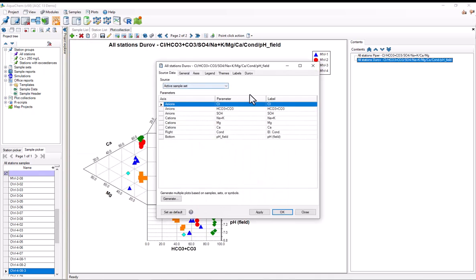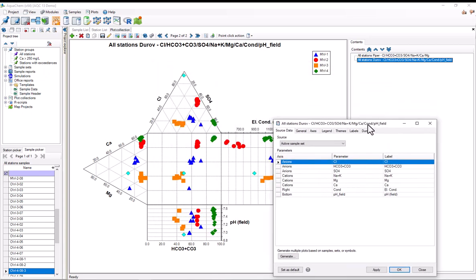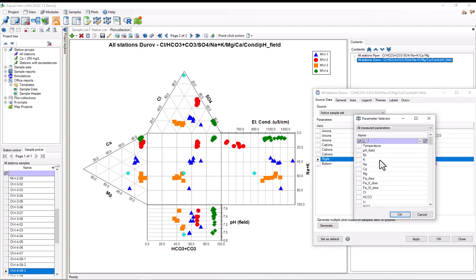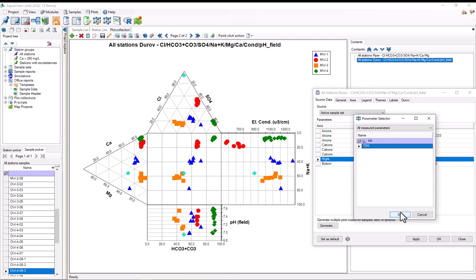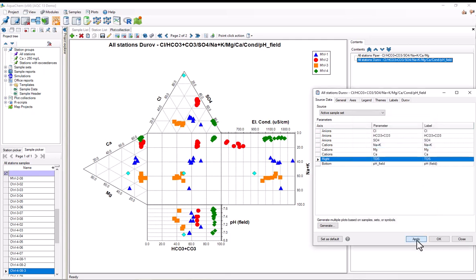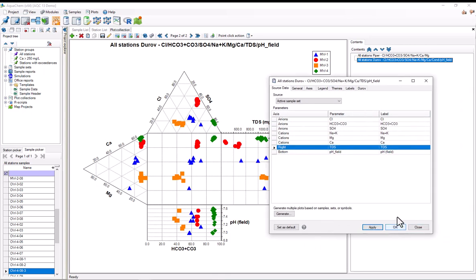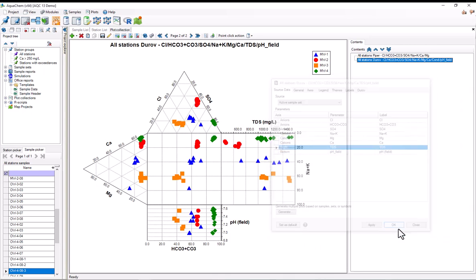Customizing a Durov plot is almost exactly like customizing a Piper diagram. For example, if I wanted this right chart to have total dissolved solids instead of electrical conductivity, I would simply find the electrical conductivity parameter here on the axis table, select it and filter for TDS, select it and hit OK, and apply. And we can see the changes that we made.